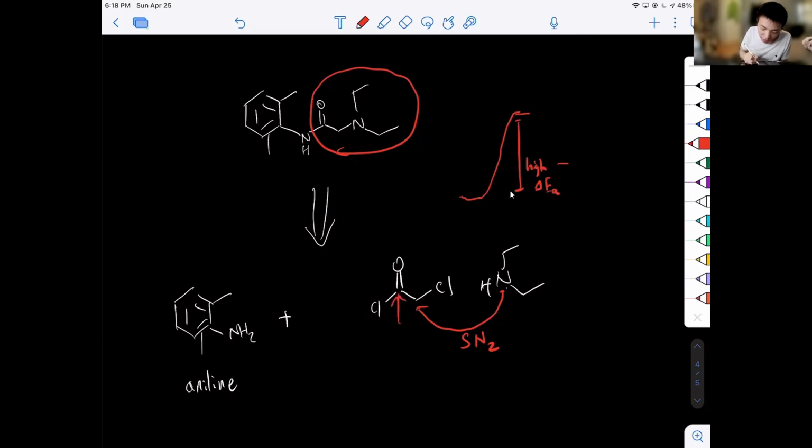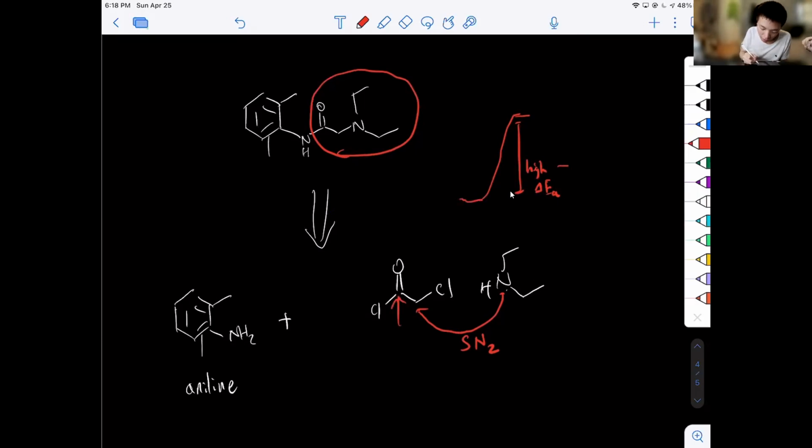And meanwhile, the left-hand side, in case Dr. Rudick asked why, is because that one is more electrophilic. This is the hot spot to have reactions or nucleophiles to attack.